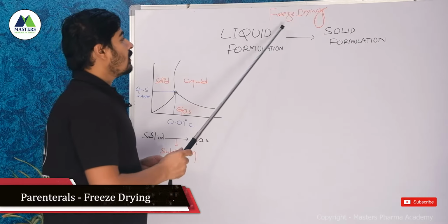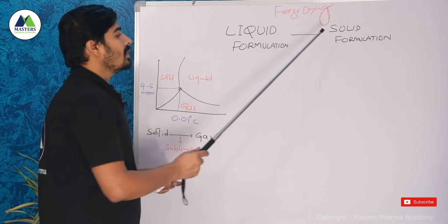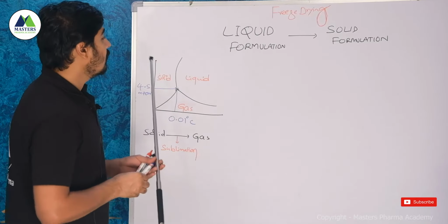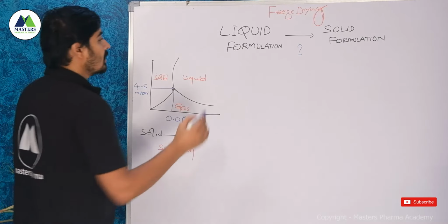The next important topic in parenterals is freeze drying. Generally, why are we performing this freeze drying? Freeze drying is nothing but the conversion of a liquid formulation to a solid formulation. So, first the question: why is it required? The conversion of liquid formulation to solid formulation.